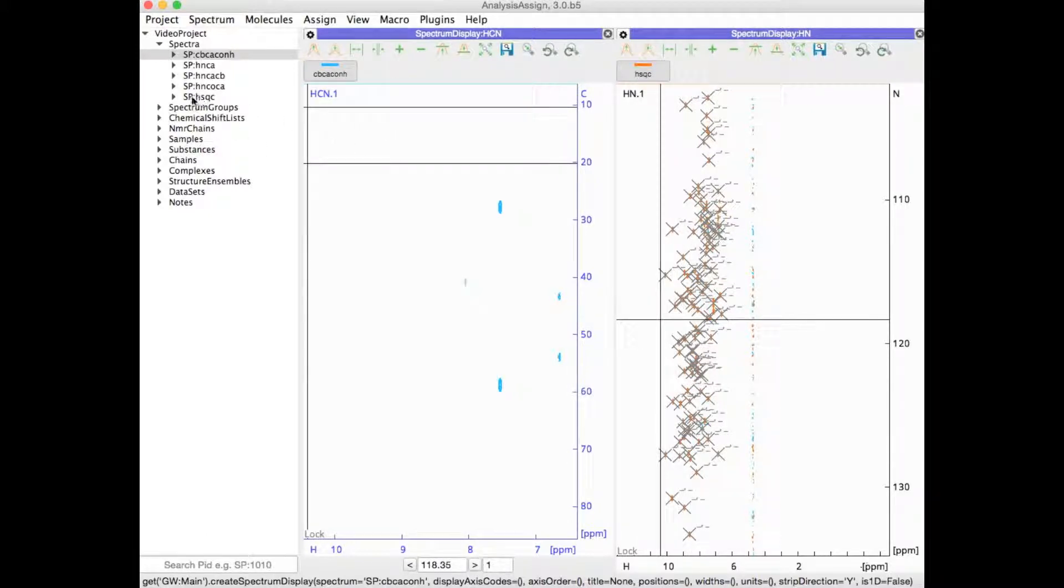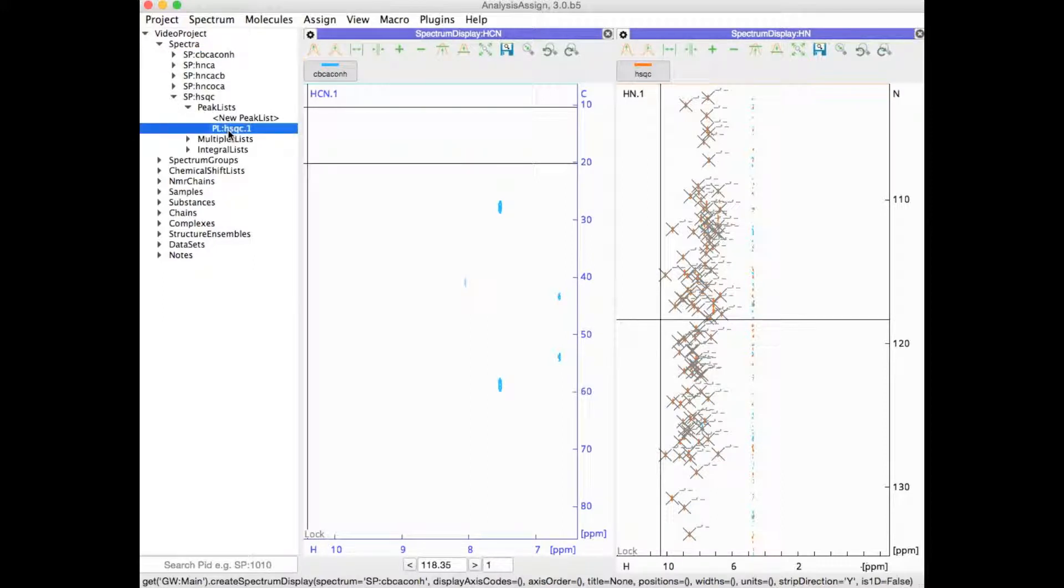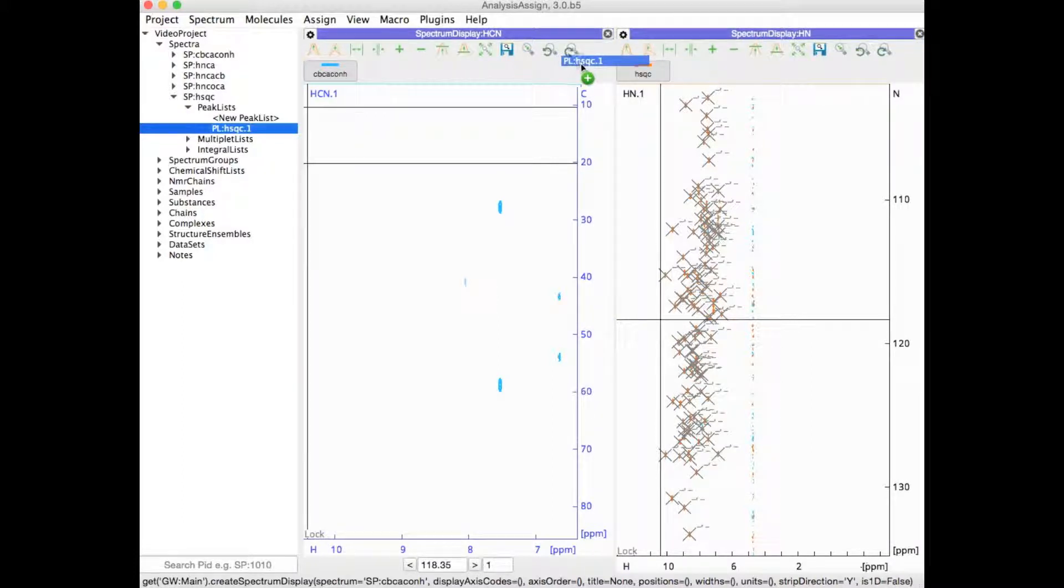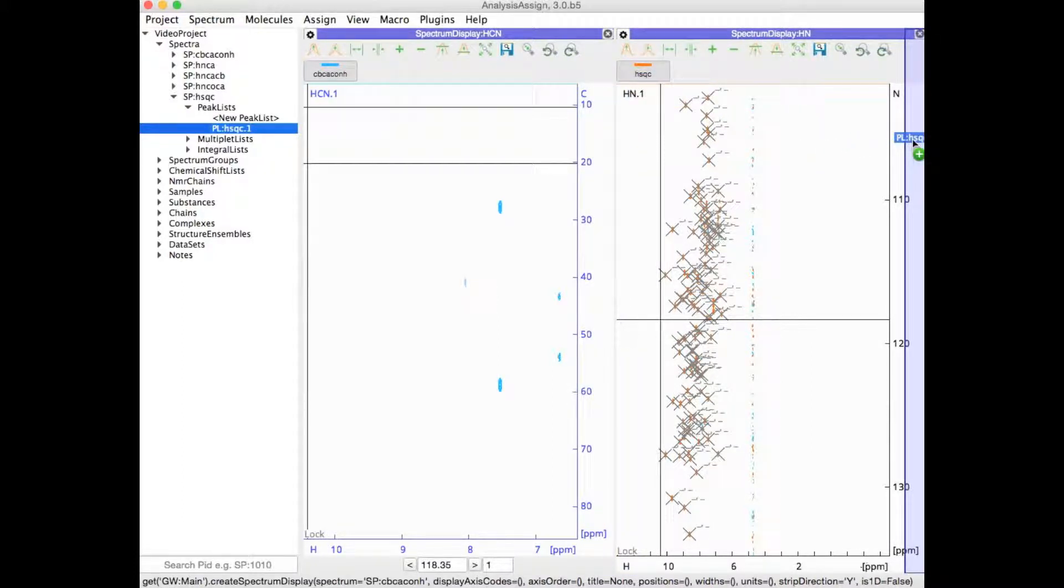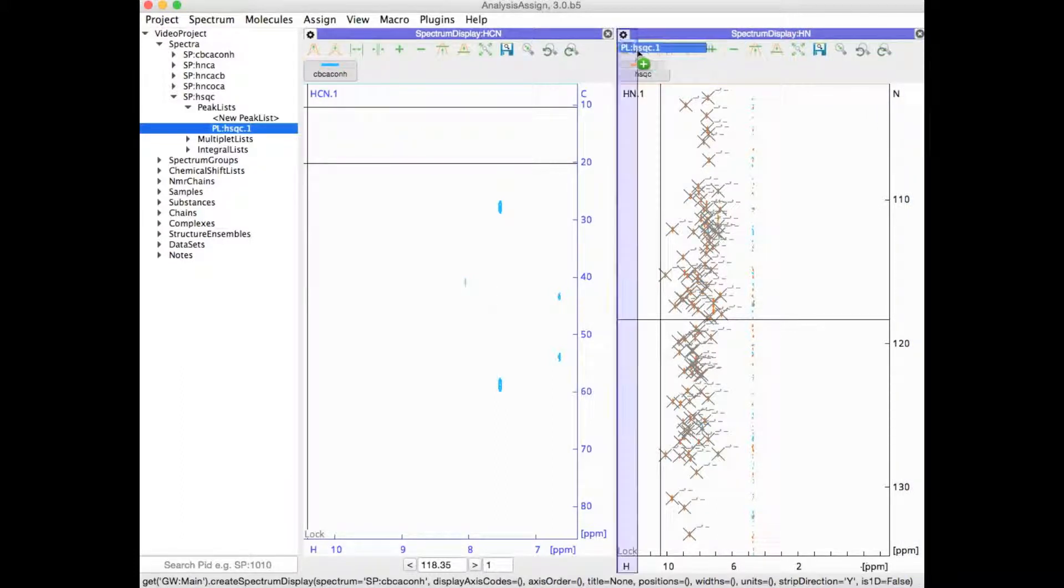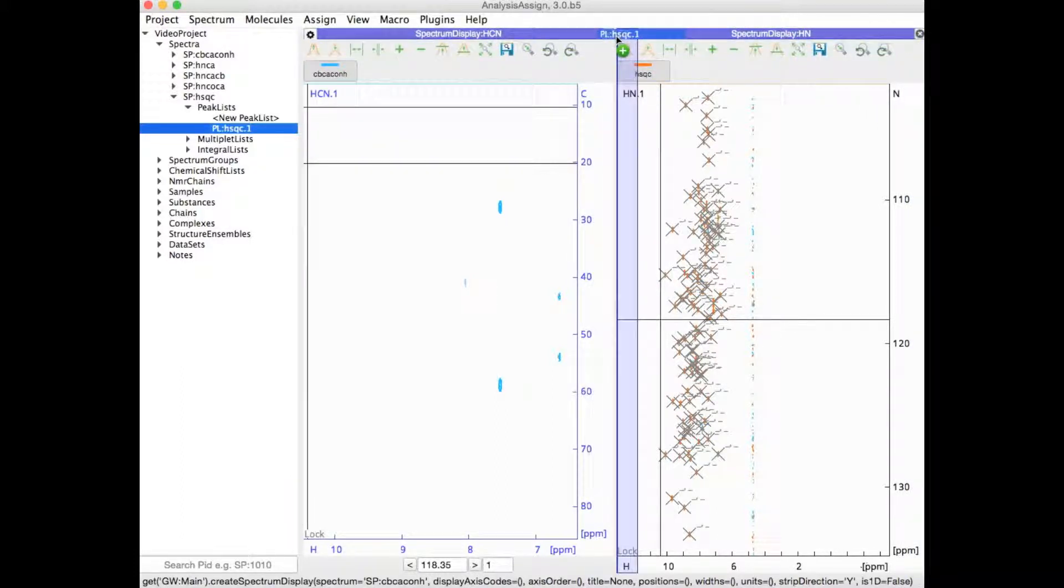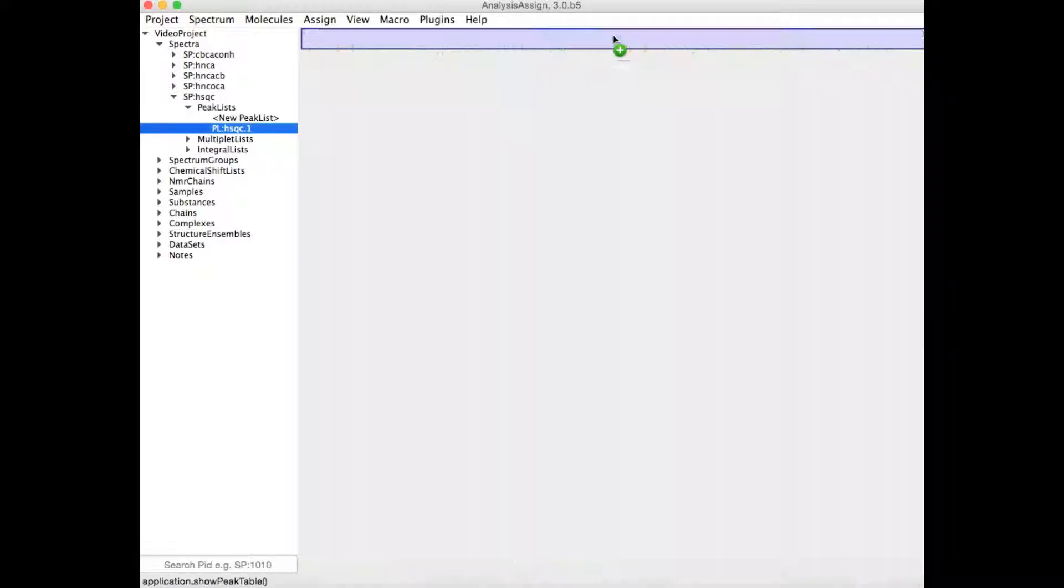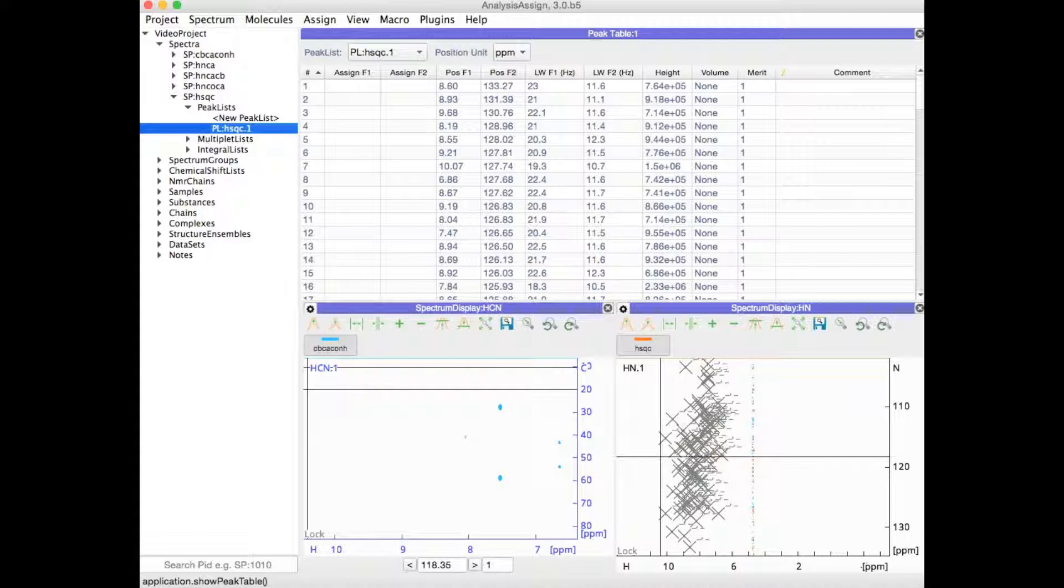You can also open other data items such as peak lists and drag those where you want to place them. Again, at the edge of any current module, you will see where you could place this. If you go to the edge between two modules, it will span across both and you could have your peak table spanning across the full width of your drop area.